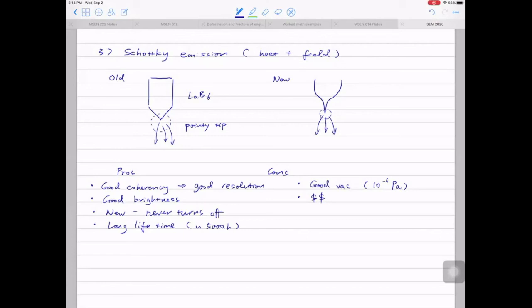Yeah, so you said the new one is also tungsten? The new one is also tungsten. To be specific, it's 001 tungsten single crystal. And you also said that the SEM JEOL that we have at MCF is the cold field emission, right?